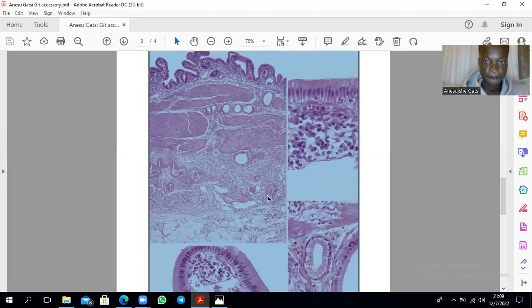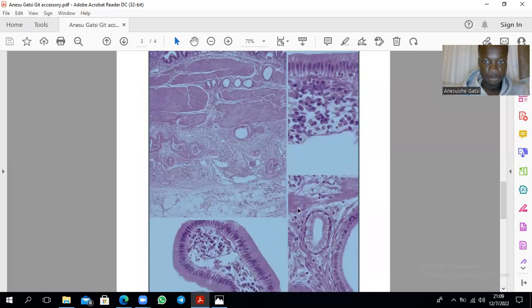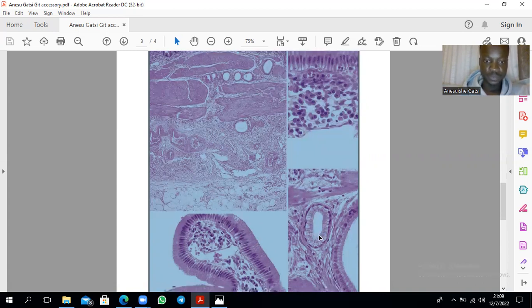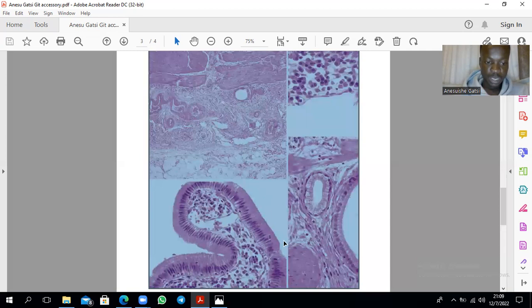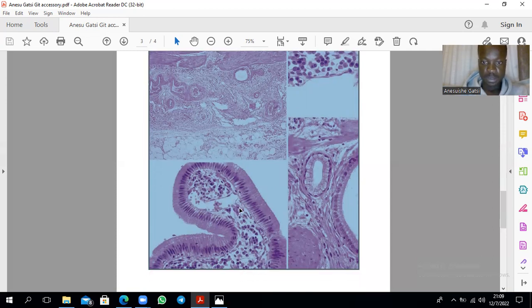Then that's a mucus producing gland. And those are the mucus cells. Right. Then this is another form of epithelium, folded. Right. And this at the center there, that's connective tissue. Just loose, you can see by the presence of an equal proportion of cells to fibers. Then there's an example of a blood vessel.